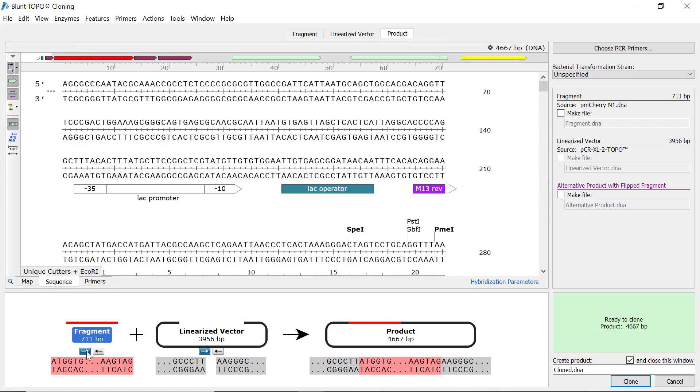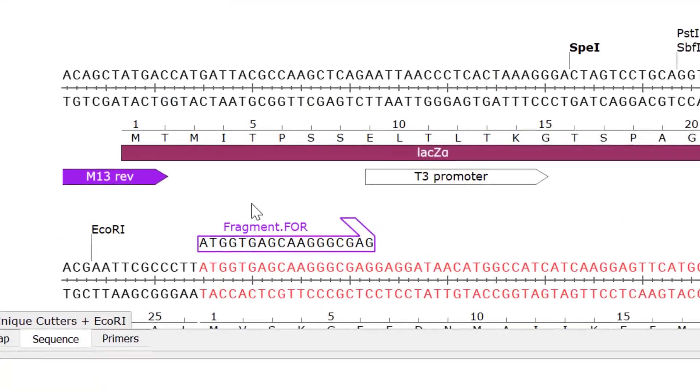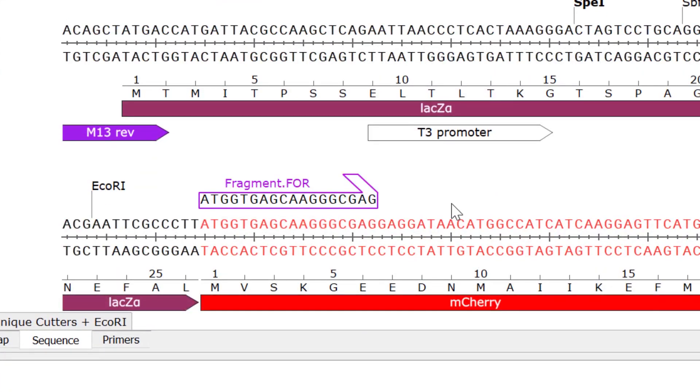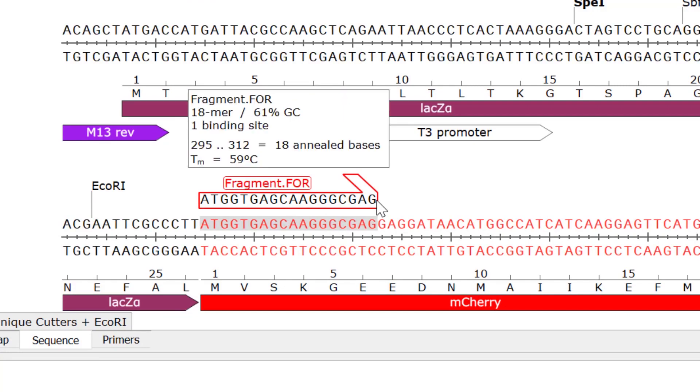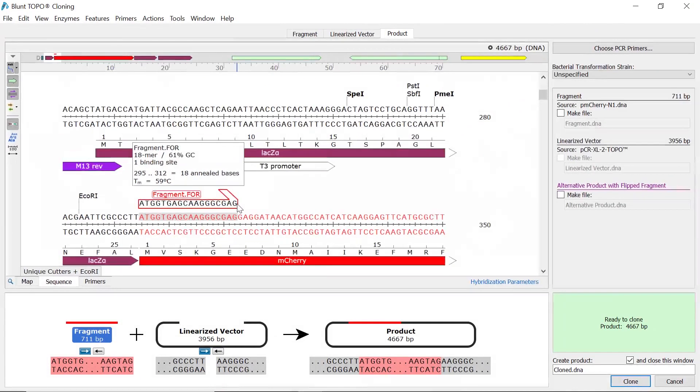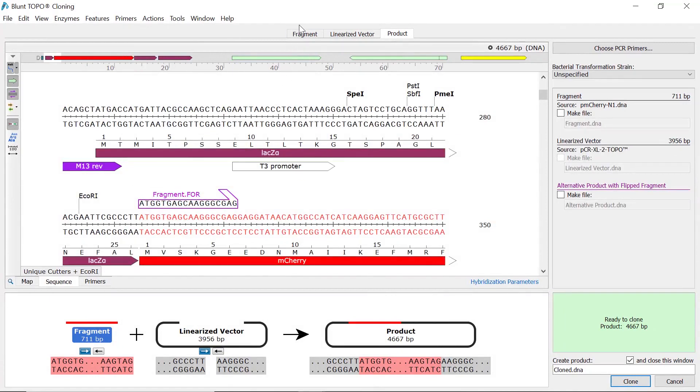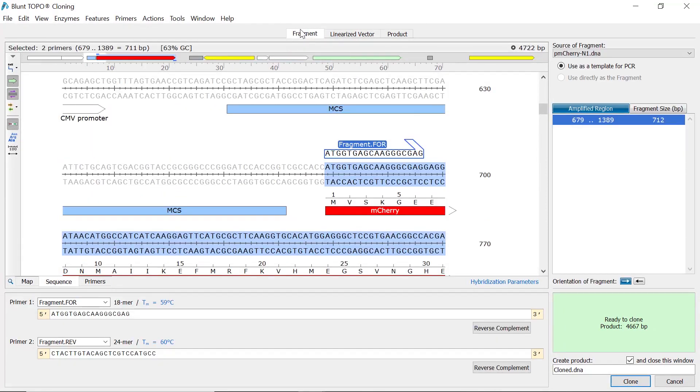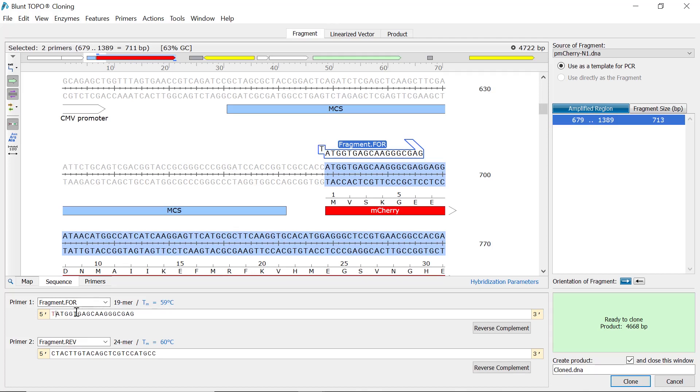You can also see the primer sequences and their binding regions on this screen. If you need to add nucleotides to the primer sequences, such as to ensure the fragment is in frame with the vector backbone, then switch back to the fragment tab. You can manually edit the primer sequences using the bottom boxes. It's also possible to rename the primers here if you wish.